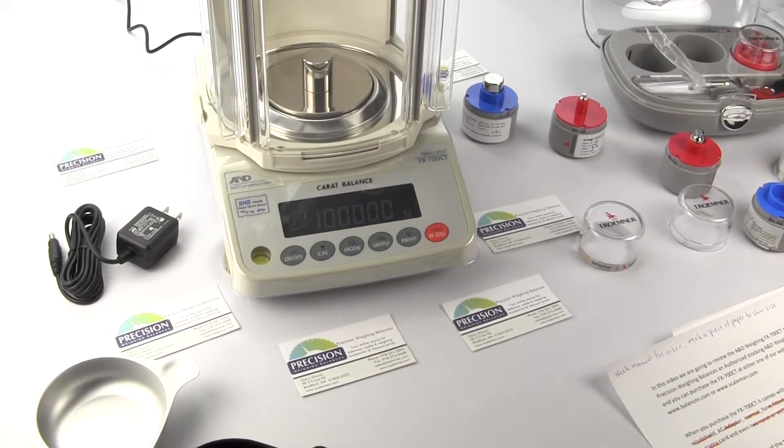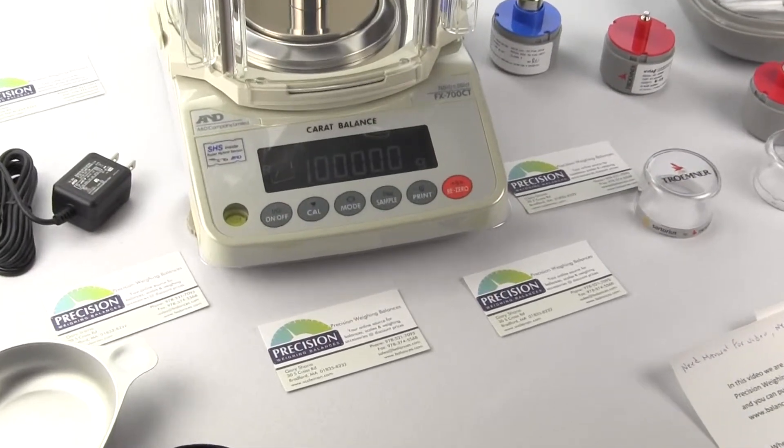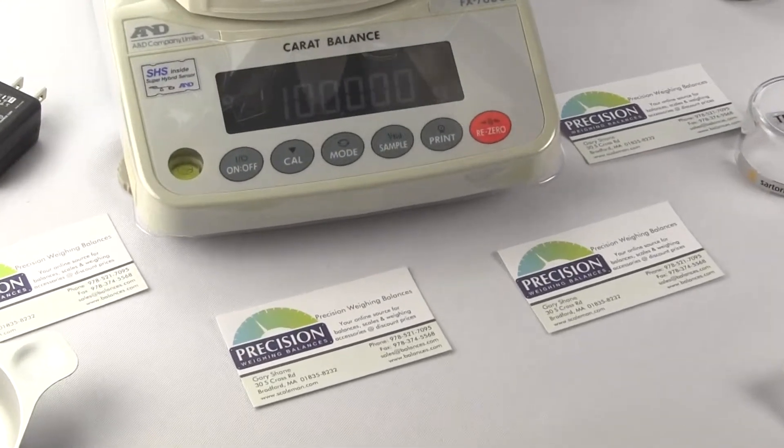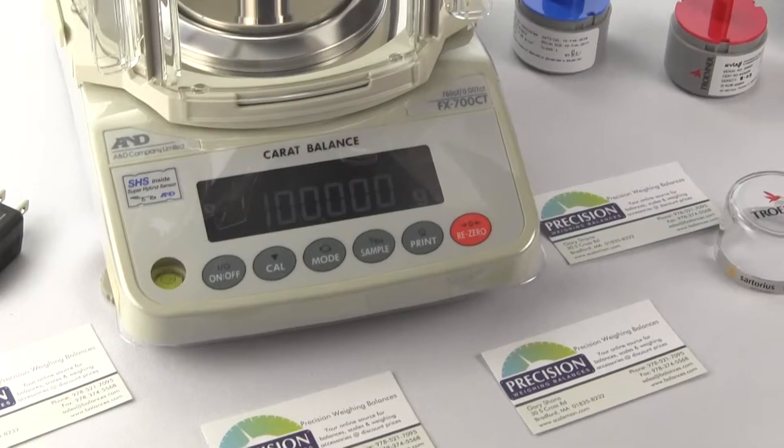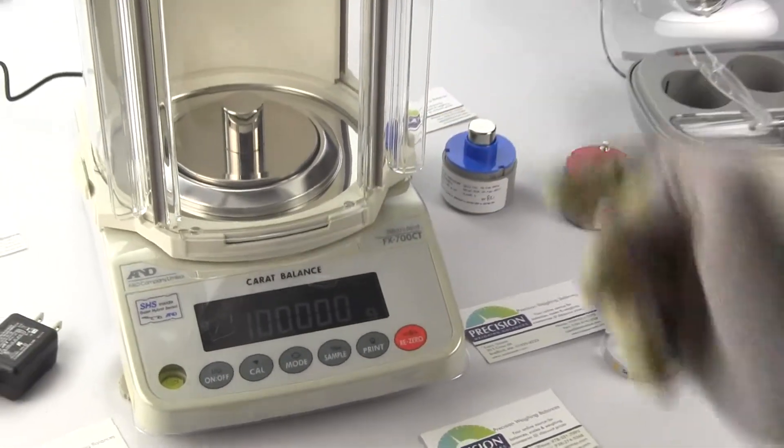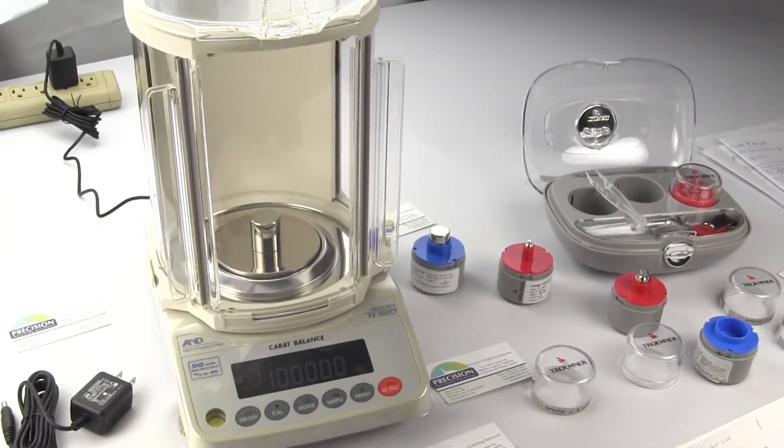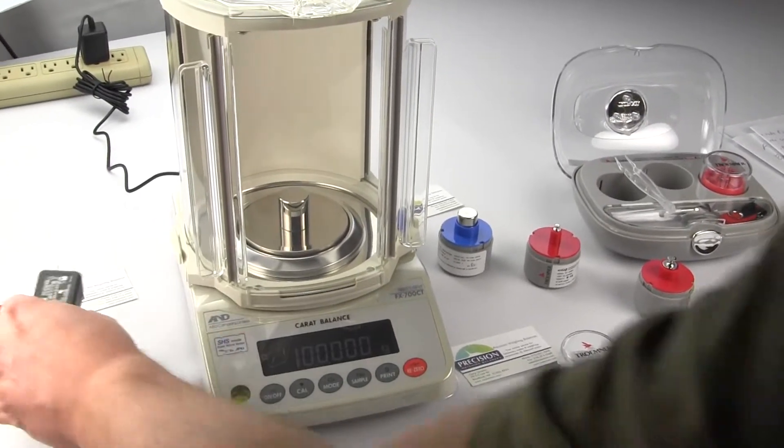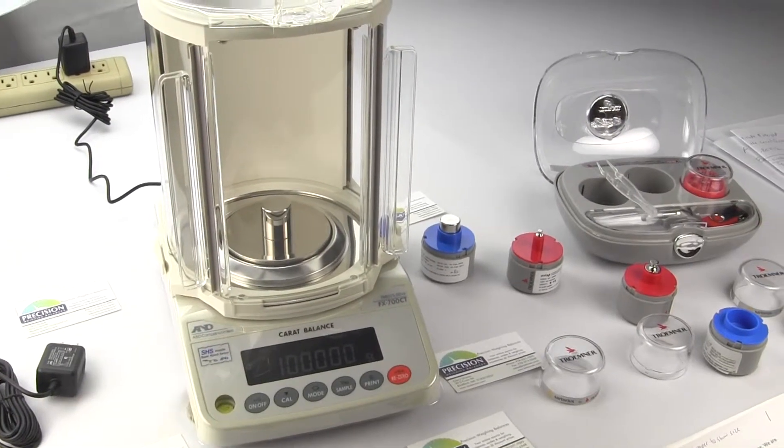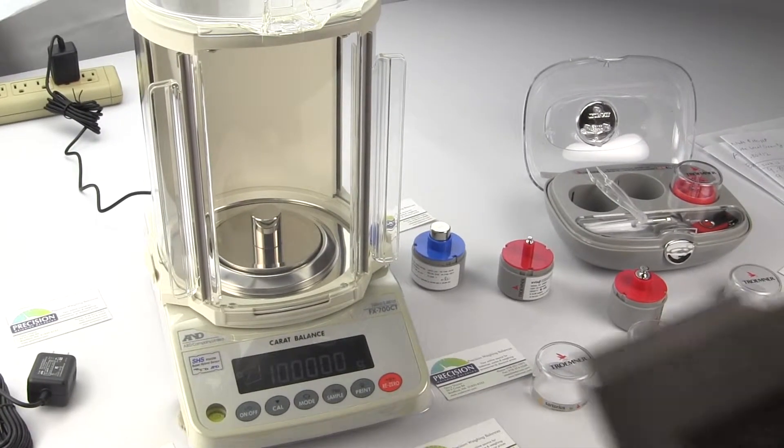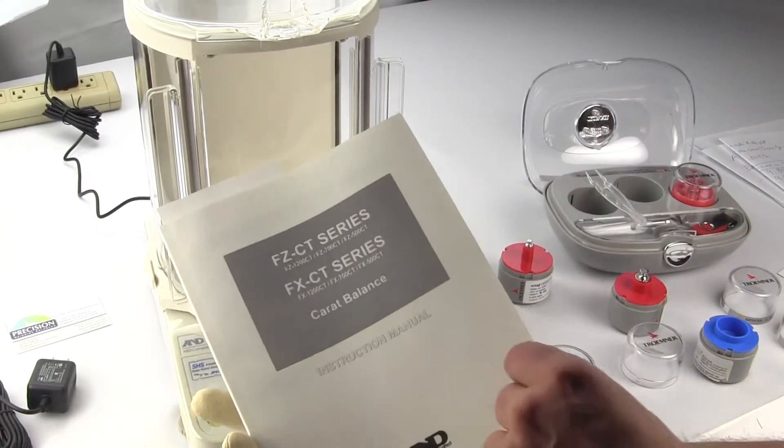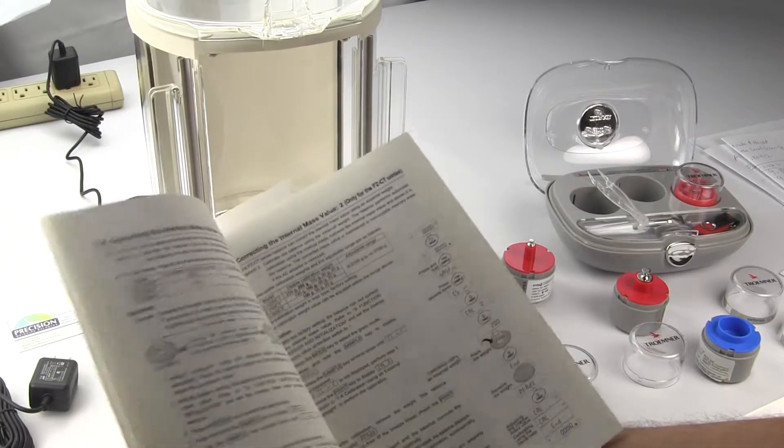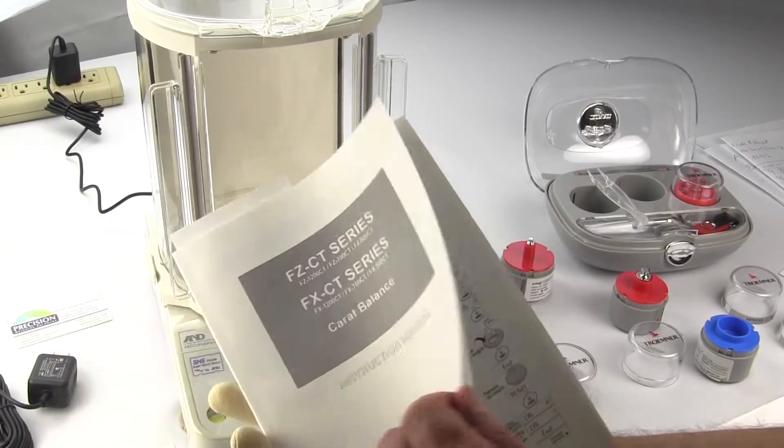When purchasing the FX700CT the balance comes with this large tall 7.1 inch windshield. It also comes with the AC adapter. There's a well-documented user manual here and the manual clearly defines all of the steps.